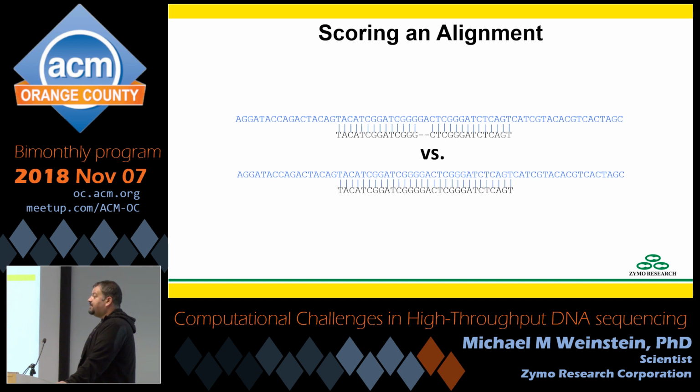So how about scoring and alignment? As I mentioned before, a common theme you'll find in a lot of these methods is you won't just get back a base call or an alignment call, you'll get back a confidence in the call. So an example here, what would score better? We have one alignment with a 2-base deletion. We have another alignment that's a perfect match. Obviously the perfect match is going to be a much higher confidence.